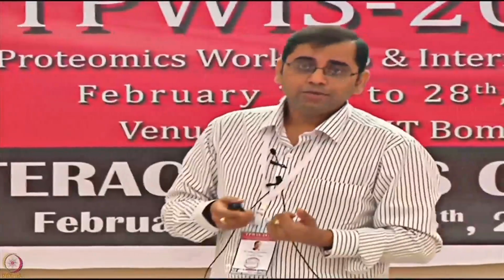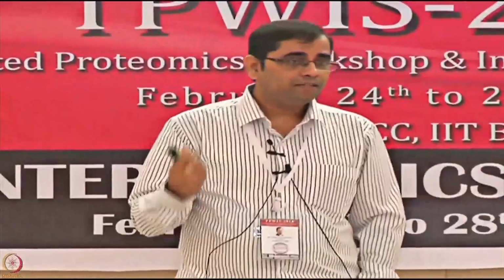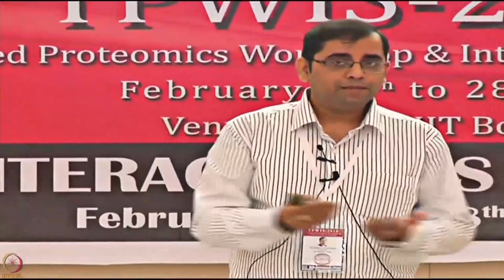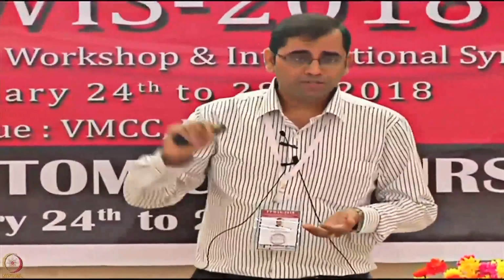More importantly, in the case of microarray or other kinds of label based platforms, you are only measuring the signal at the end, which gives you an idea whether it happened or did not happen. So you have a positive signal or a negative signal. So an interaction happened or a biomarker is present, you can just say qualitatively it is showing you signal. And of course, you have many different measures of having different controls which could be used to do the quantitation as well.